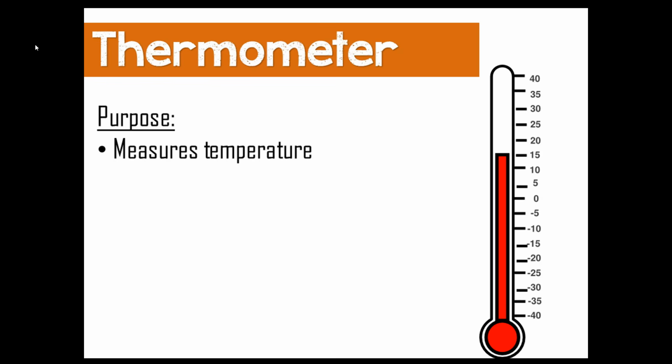We're going to use the thermometer quite a bit this year. There are different thermometers. We have digital thermometers, and then we have the old manual traditional thermometers. We will talk about in our measurement lesson specifically how to read a thermometer, but you need to know that thermometers measure temperature.